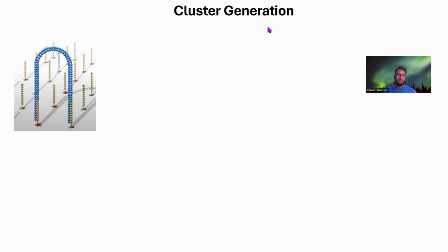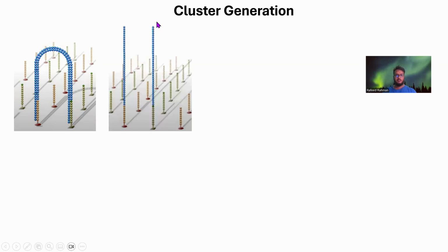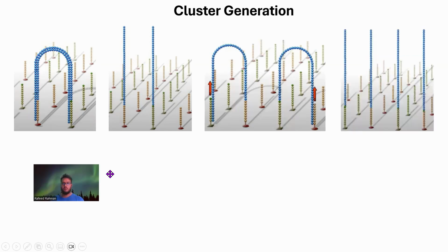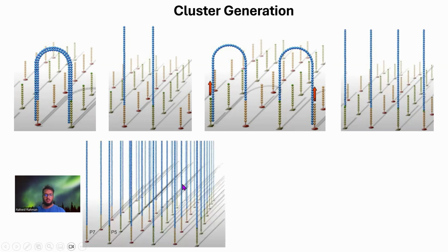In cluster generation, the first step is to use the DNA polymerase enzyme to create the complementary strand. Then if we denature, a forward and a reverse complementary strand are created. Then again there will be this bridge structure, and again we will have DNA polymerase enzyme creating 4 strands from one. If we continue this process for multiple cycles, it will give a nice cluster of this fragment.